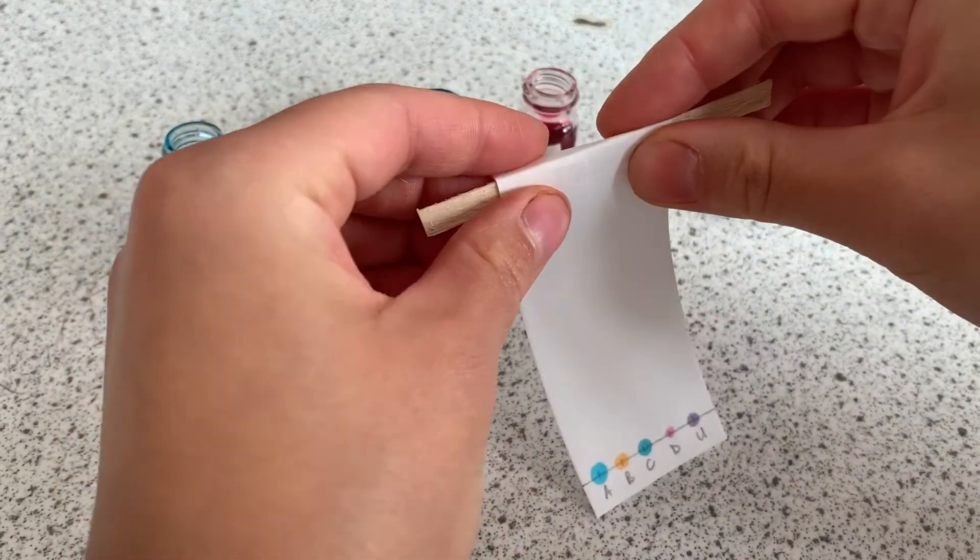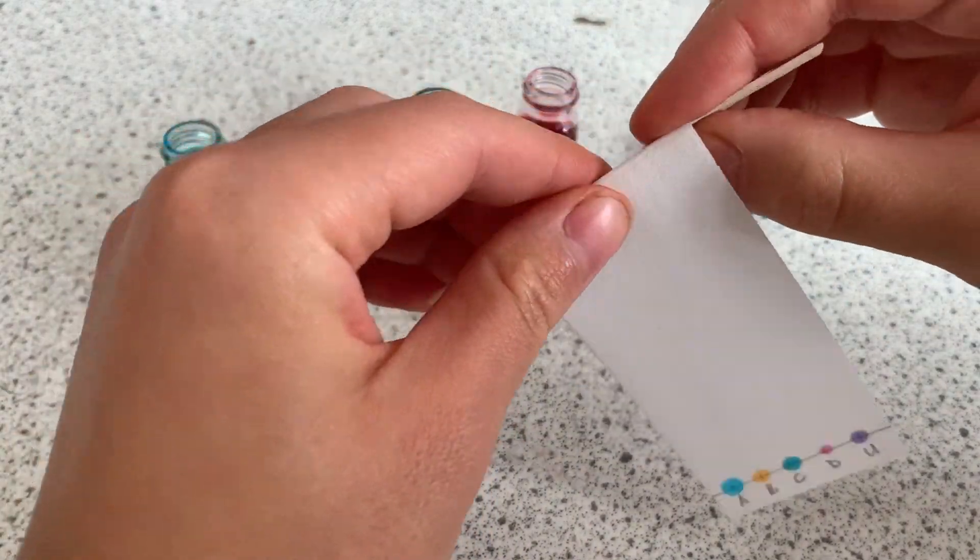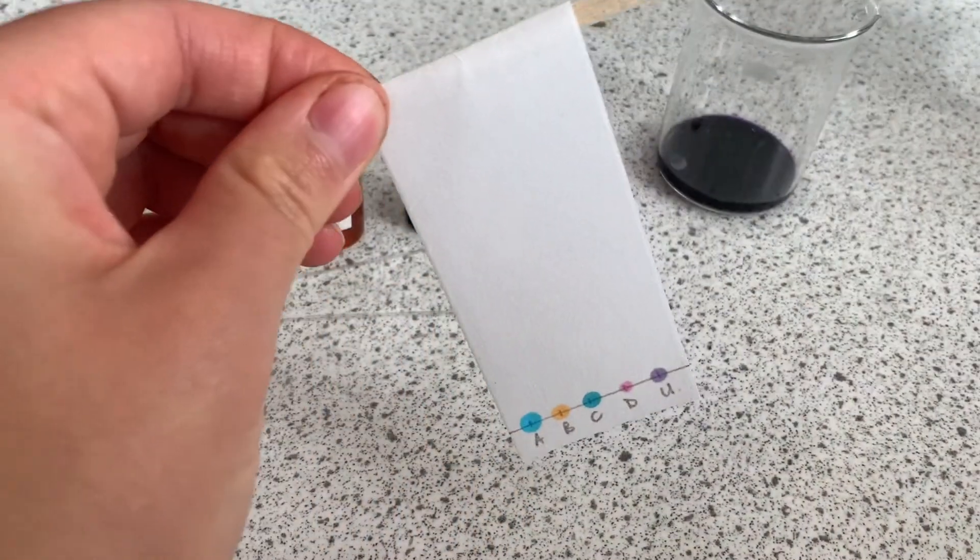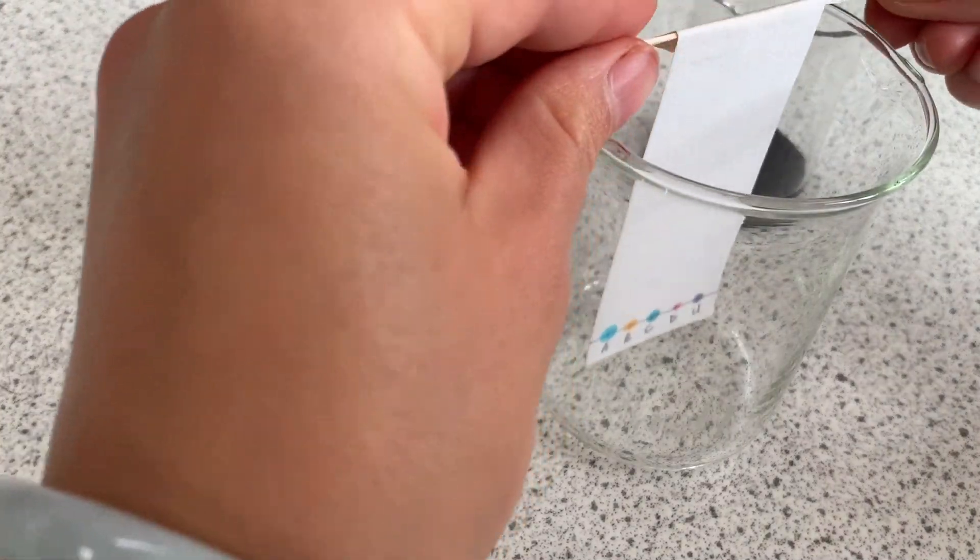When you're done tape or fold the top of your paper over a splint or something similar so that the paper can be suspended into the beaker.